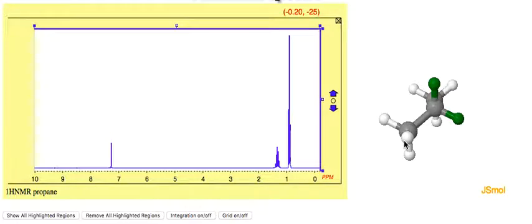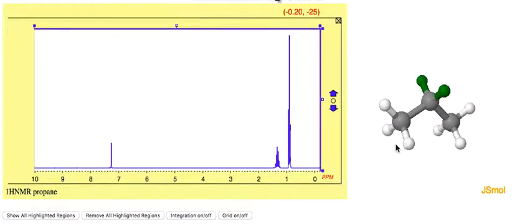Okay, so now here I have propane, and this is a secondary reference peak. And here in propane we have one peak here, which is those 6 hydrogens that are all equivalent to one another, and then this different peak here, which is those 2 that are there. Now if I turn on the integration, we can see that here we have the height can be measured here, and then the height can be measured here, and it's in a 1:3 ratio, or pretty close to it. And 1:3 can be also 2:6.